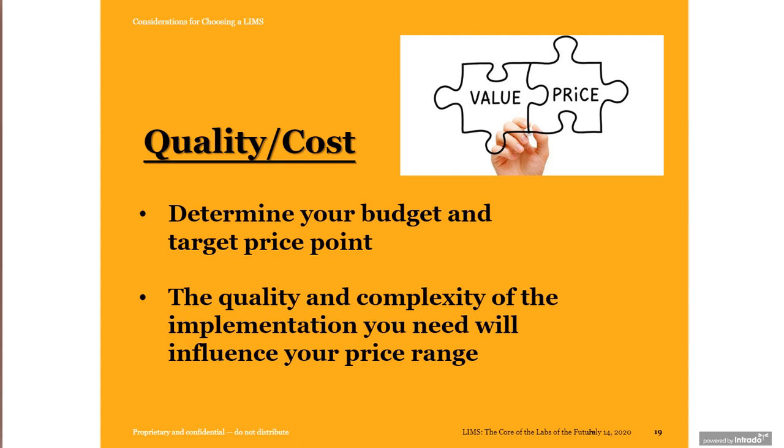And of course, quality and cost. So you need to determine your budget and the target price point, and the quality and complexity of the implementation. Of course, that will impact the price. Not the cheapest system will be the best, nor the highest price system. It will depend on what you want to do in terms of implementation, what I call the big bang approach or a phased approach, and how many ancillary solutions I want to implement within my system.